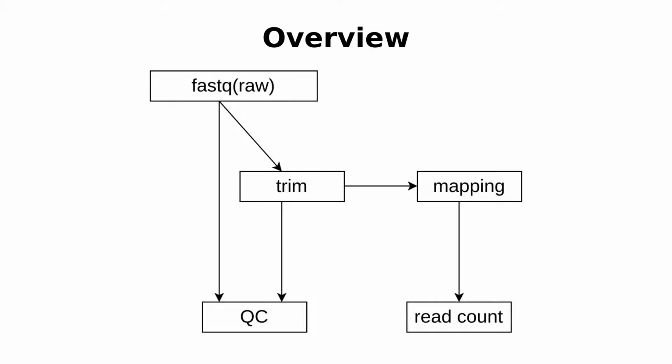I have a separate tutorial which shows how to map using STAR. So for those who want a detailed explanation of how STAR works, just check the description box. You will find a link to that video. So let's proceed. With the mapping session, we are first going to start with indexing, and then we are going to do the mapping itself. So let's take note of that.